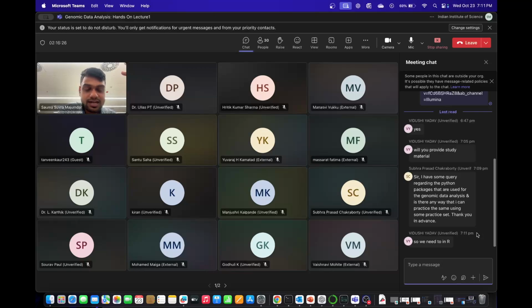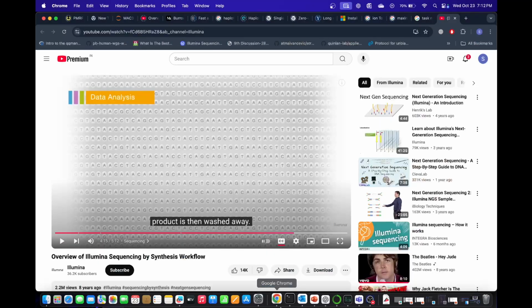the software that we use for alignment, for example BWA-MEM or GATK modules, those are actually written in C++ or Java, because we have to optimize space and time very carefully. The amount of data is huge and the time taken to do this is also huge. So generally, these algorithms are not written in Python. They are generally written in C++ because it's a faster language. But in Python and R, you can also do this. There are packages. Let me see if I can find them.